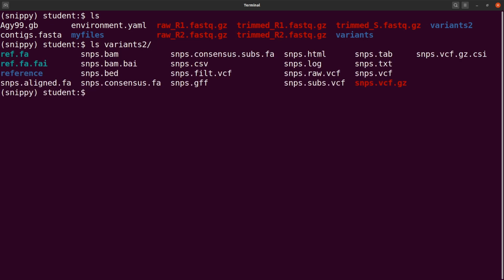You can just do an ls, check the files, use Linux commands to count the number of variants, just explore these files here, use Python to get some information. Once you have this output file here, you basically do the same thing we did with the other one.